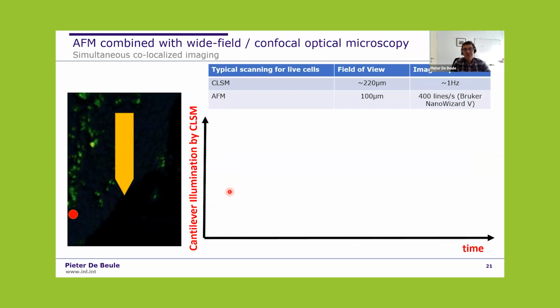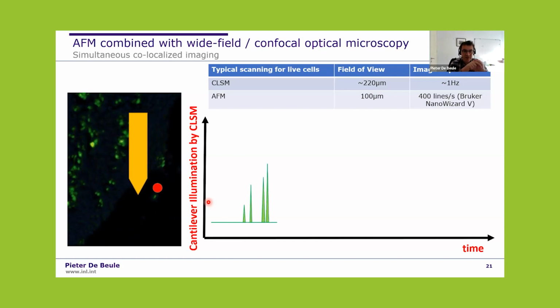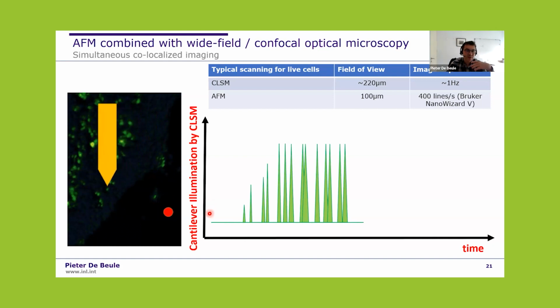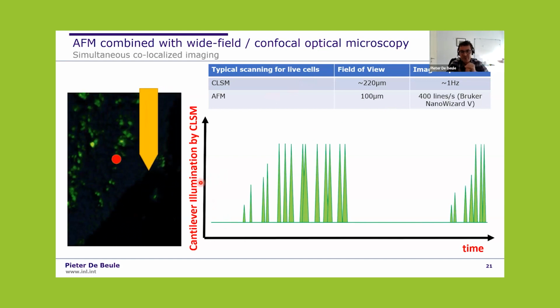One thing to bear in mind, and I know that the integration of confocal microscopy with BioAFM has been relatively popular, but I just wanted to point out that typically when this integration is done, and you are operating both the AFM cantilever and the confocal microscope spot at the same time, when the confocal laser scanning spot hits the cantilever, the experimentalists remove the data point. That's because the light contained within the confocal laser scanning microscope is relatively powerful, especially since it is focused, and it distorts the movement of the atomic force microscope cantilever.